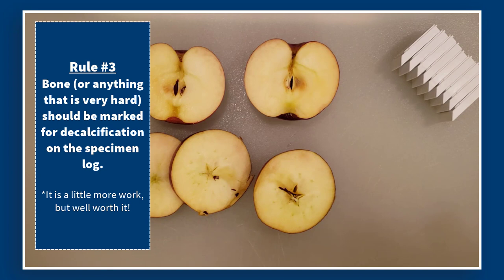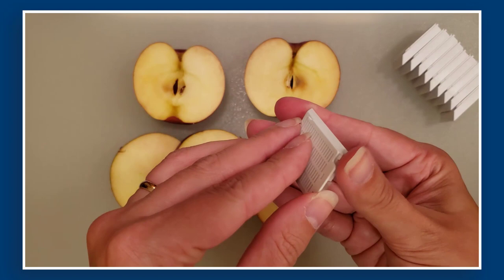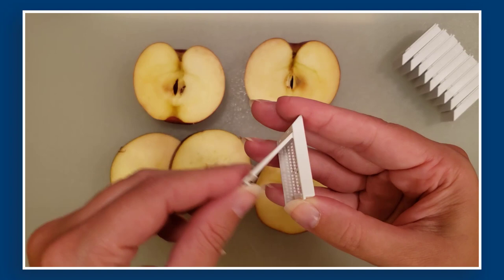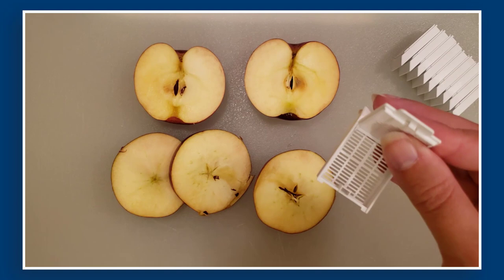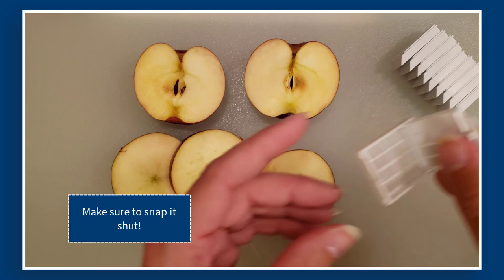The only other limitation is if you take a section of bone — we can do that, you just need to mark on the sheet that it needs to be decalcified. When you find an area you want to look at histologically, you're going to take one of your cassettes and open it up — it pops open on the back side and has a nice little hinge. Open it up and you can put in multiple pieces of tissue, making sure they're not so small that they fall through the little holes.